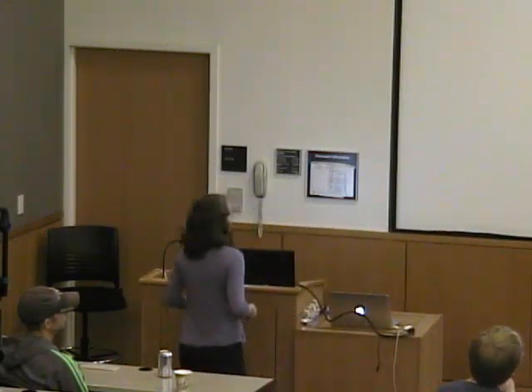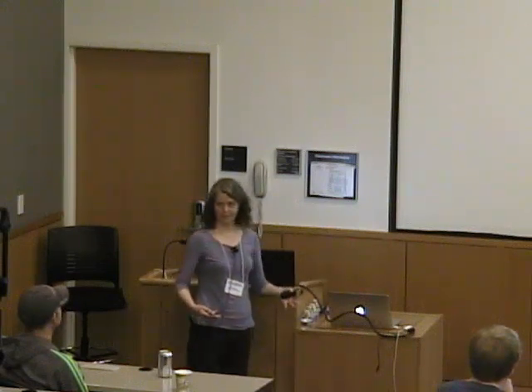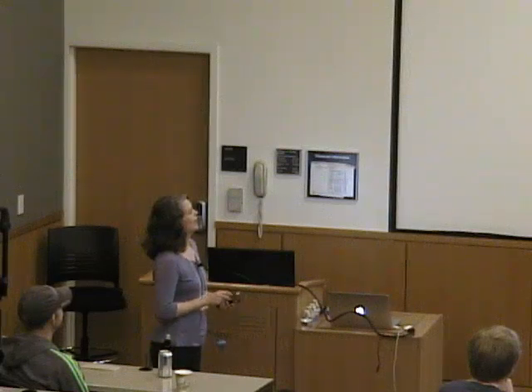All right, so if you're not quite as brave to do those kinds of experiments, I don't know if I would have been, you can also do things to give you a lower amount of relaxation. I mentioned before, azurin with its really broad lines, you can substitute it with nickel-2, and it's still paramagnetic. But now you can directly see the cysteines without going to these extraordinary lengths. This gives you a system that's easier to analyze. Of course, then you don't have the native metal, but you can still do a full, detailed structural analysis and do other studies on this system.